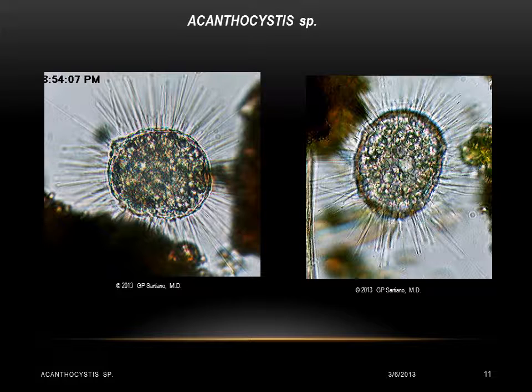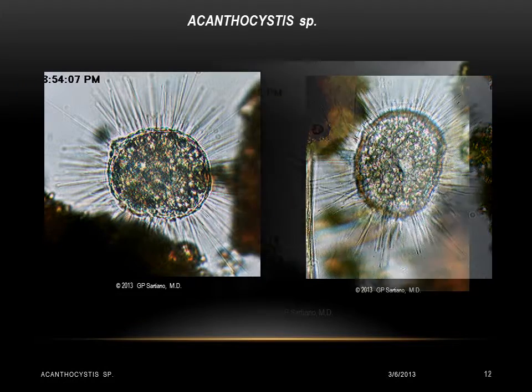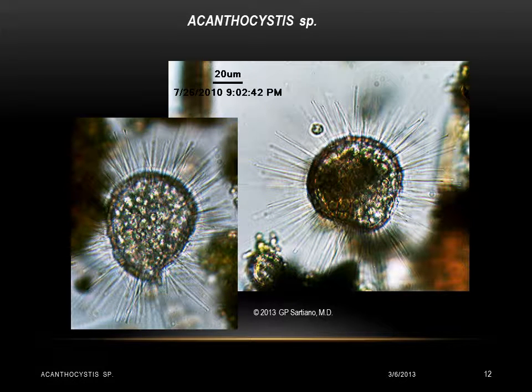Here, the organism on the viewer's right seems to have squeezed itself a little bit in passing between two promontories, while the one on the left has a little nubbin at about 11 o'clock. Here on the viewer's left, the organism has developed a pointed projection as it passes through a narrow space, and the organism on the right has developed a rather prominent nubbin at about 5 o'clock. It is possible that the organism on the right is budding.